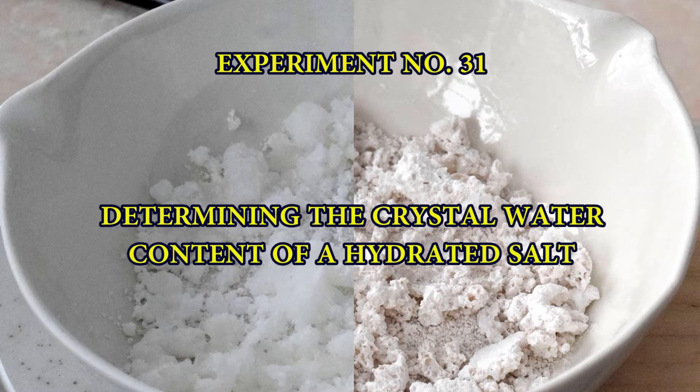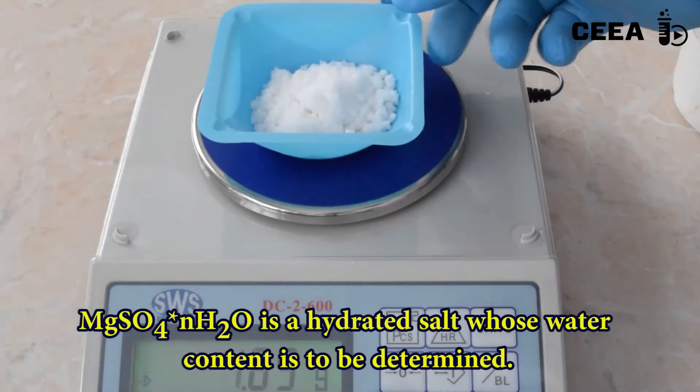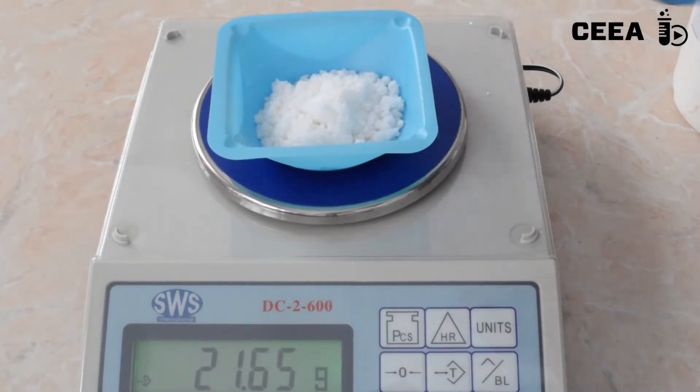Experiment number 31: Determining the crystal water content of hydrated salts. Magnesium sulfate is a hydrated salt, and its water content can be determined experimentally using dehydration techniques.